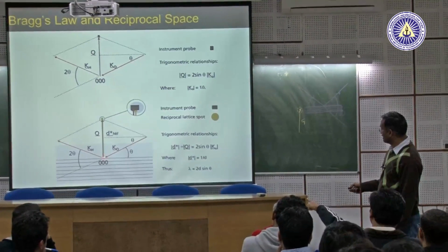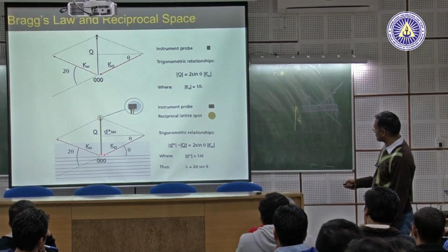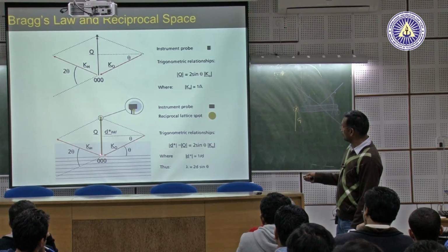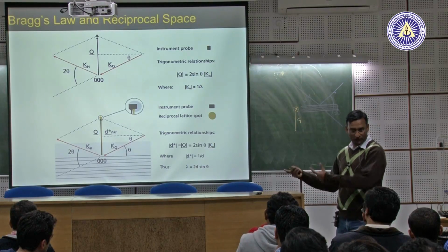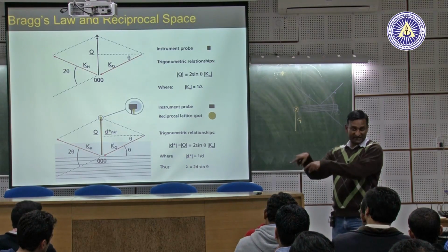Mosaic case. Well, yes, you are right, but for the sake of analysis, this point also has to correspond to some point in the goniometer. Okay? So, let us say you fix it with respect to some point in the sample, that point we will have to fix. So, each time the origin changes? No, the origin does not change, you fix the point in the sample.